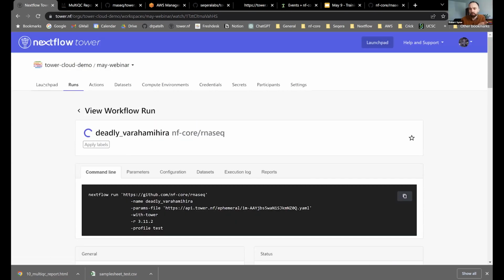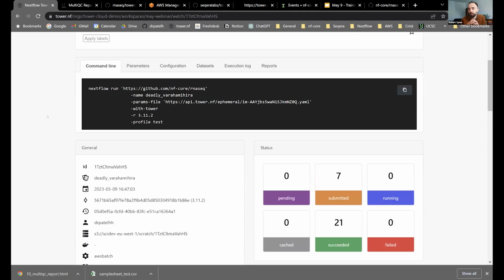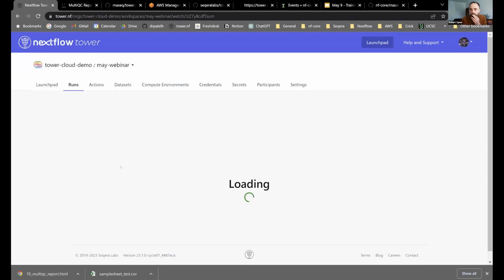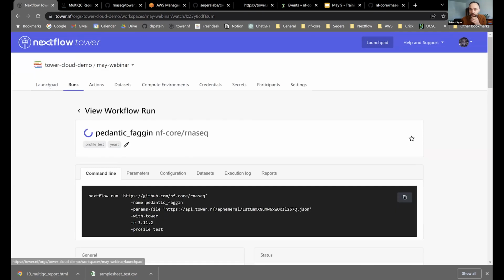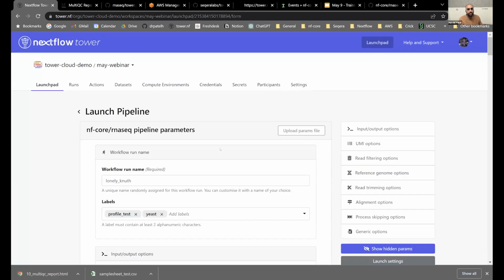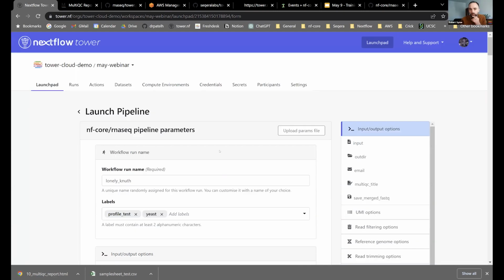I think perhaps this is a question about why when you launch a pipeline, you get the nice UI for inputs. The Nextflow schema. I see. Okay, so when you click on this, is that correct? That is different to editing a pipeline.